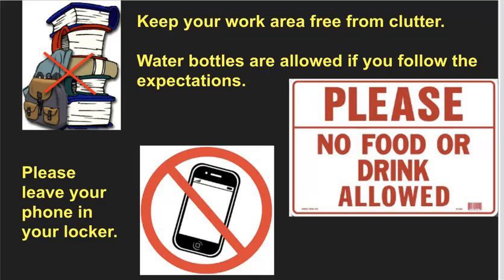Now, some things that will help keep you safe is keep your work area free from clutter. Remember, you shouldn't have bags and purses and things like that in our classroom. Water bottles are allowed, but remember, make sure you follow the school expectations. You cannot have your water bottle and food in the lab area, only at our seating area. So please, no food or drink in the lab area at all. You should not have food in our room other than designated times.